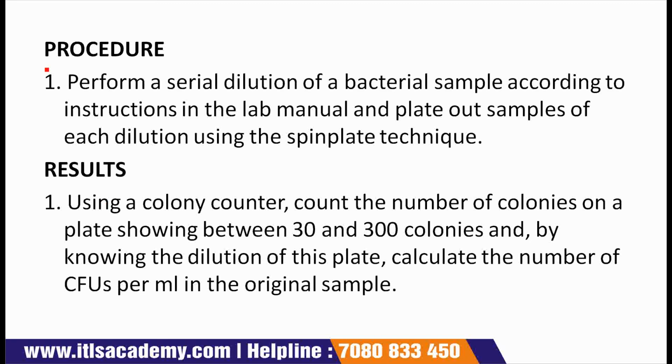So here comes the procedure for the enumeration. How we can count microorganisms. The procedure involves: perform a serial dilution of the bacterial sample according to instructions in the lab manual and plate out samples of each dilution using the spread plate technique.